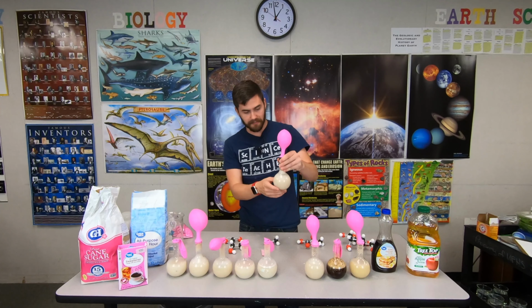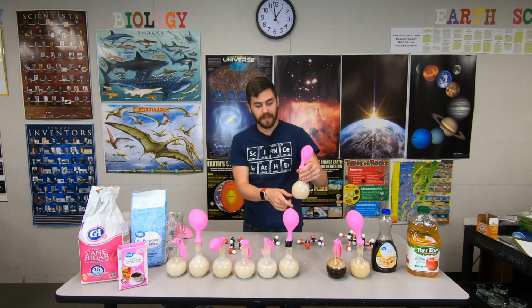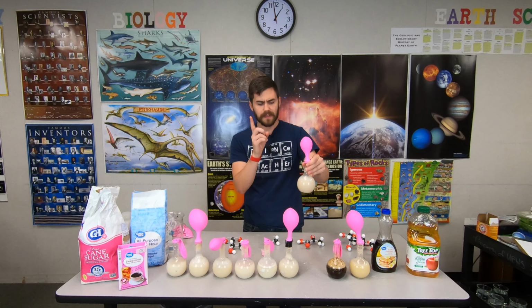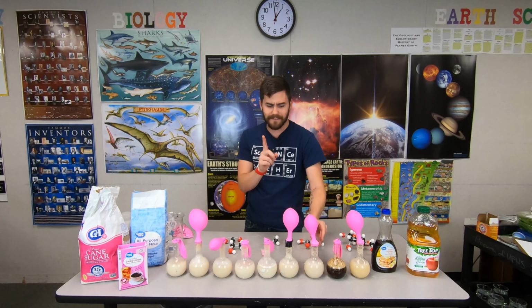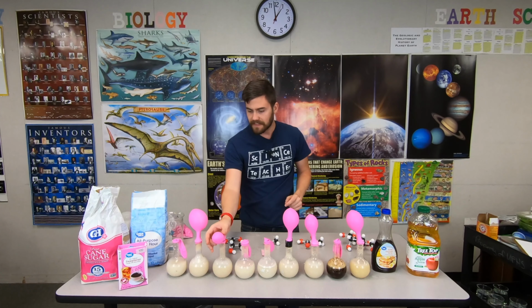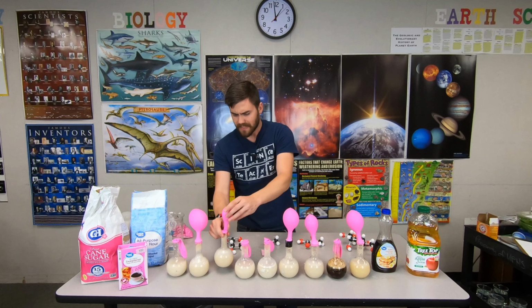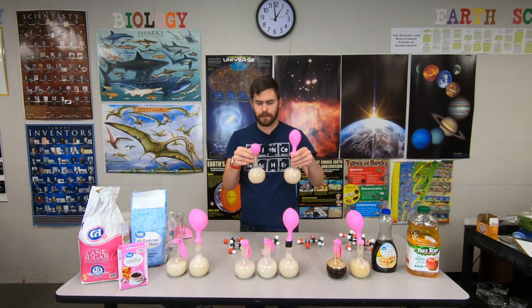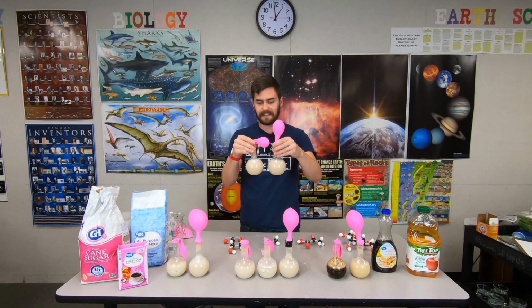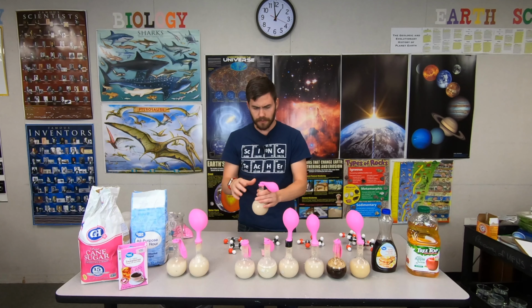The 10 grams of flour is in third place. Fourth place goes to 20 grams of flour. So more carbohydrate equaled less gas. I have an idea for why that is. The 20 grams of table sugar balloon goes in fifth place. Now I'm pretty surprised that this produced less gas than the flour balloon, since this one clearly produced more there.